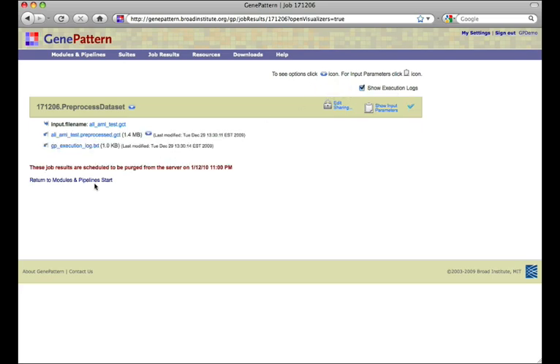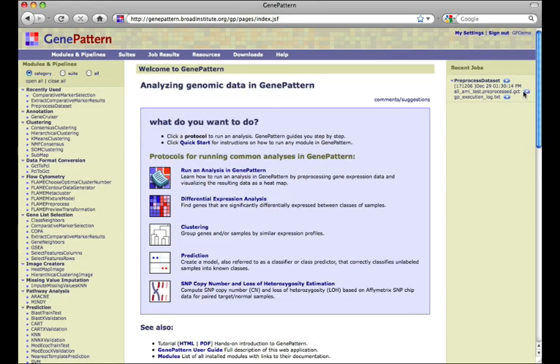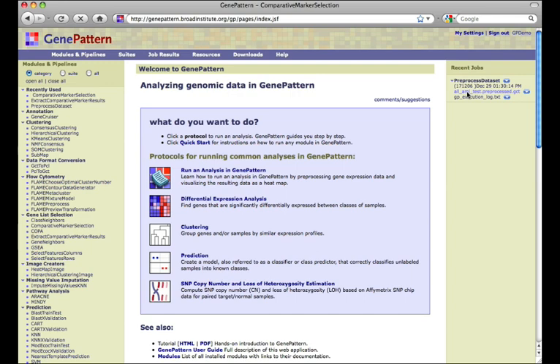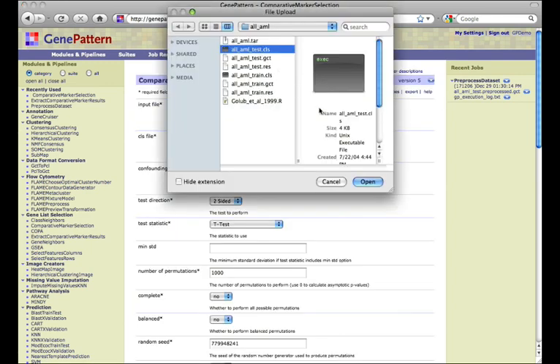After verifying the results, we pass the preprocessed data file to comparative marker selection as input for the correlation computation. Upload our corresponding .cls file and run.